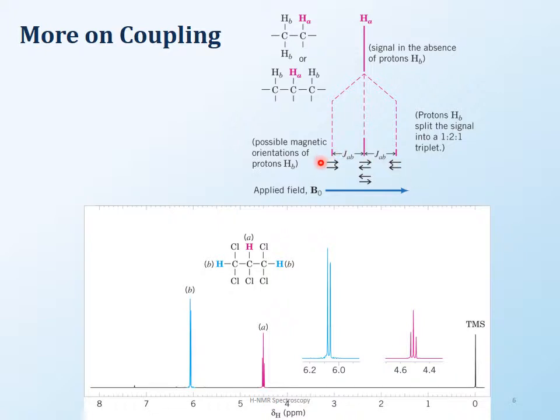The interesting thing about this is not just all of this facing and all of these alignments that are going on, it's also the ratio in which they are aligning. For example, the ratio of the alignment with and against the magnetic field is 1:1, whereas the combination of 1 facing and 1 opposing is 2. So now you have a ratio of 1:2:1. Okay, and that is what a triplet is. When you look at a triplet over here, this is how you see the alignments.